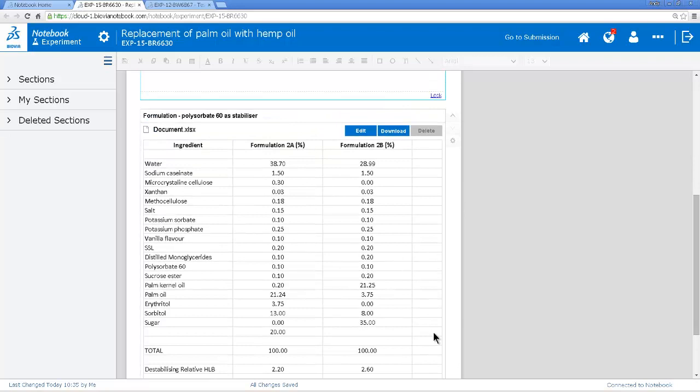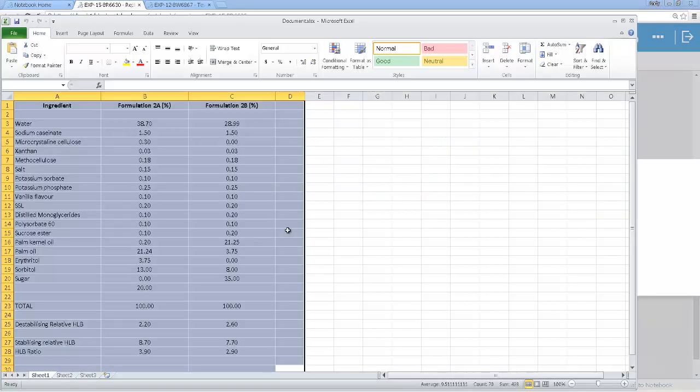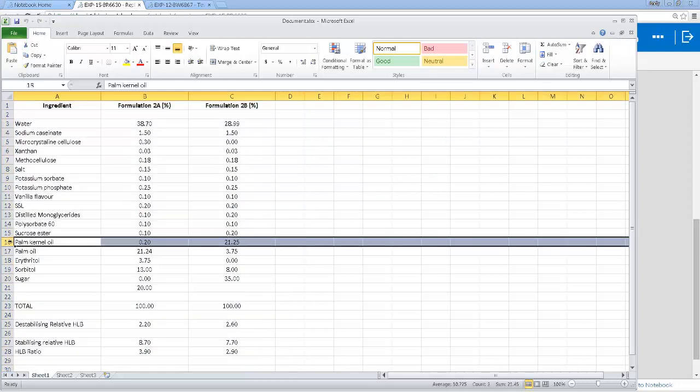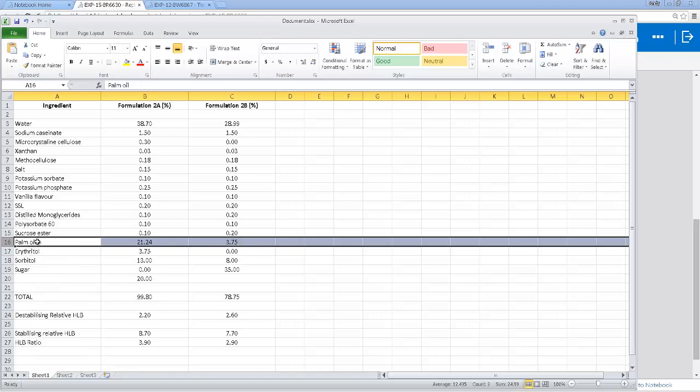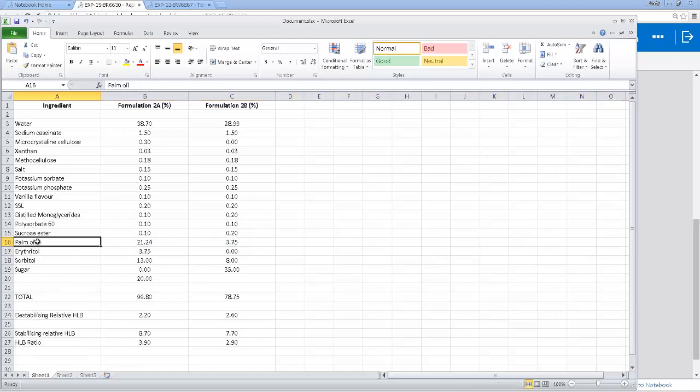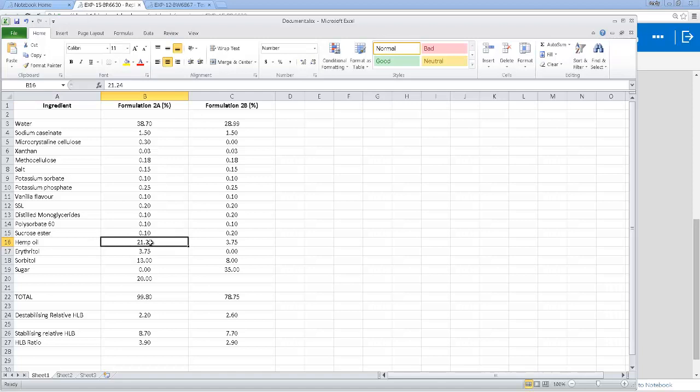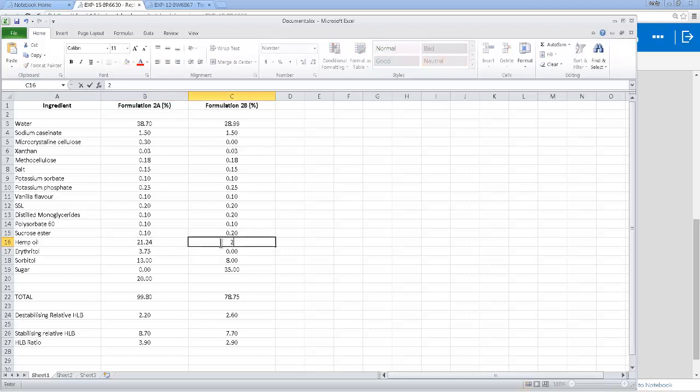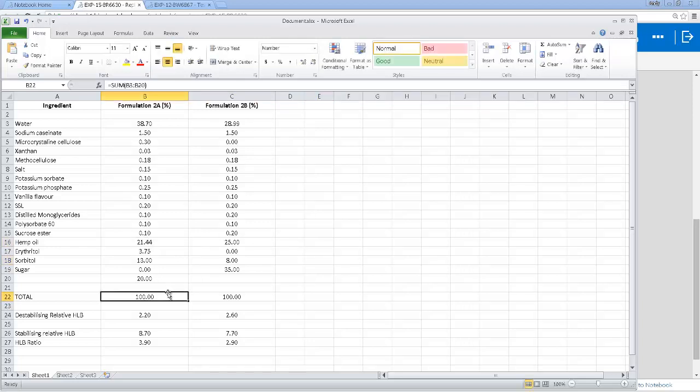So here that's been added. And now I need to modify this so that I'm going to use hemp oil instead of the palm oil. So I open up the Excel file. I don't need the palm kernel oil so I'll delete that row. And the palm oil I'm going to substitute with hemp oil. I need to change the quantities here so they add up to 100.